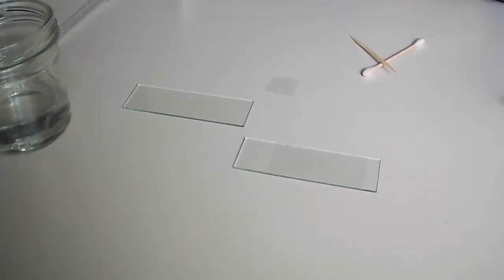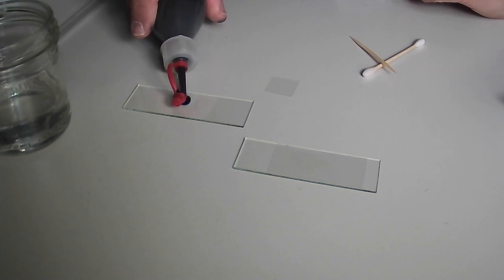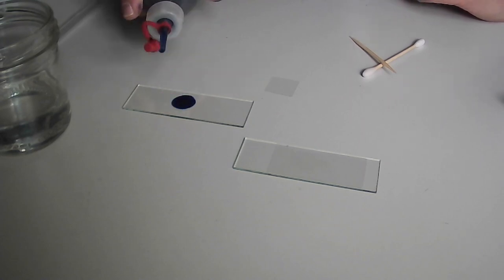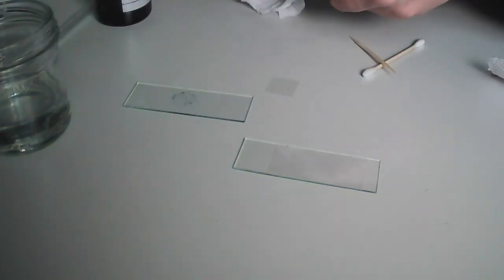Okay, so I'll be doing the following. A little bit here. So that is not the slide with the specimen, okay? That's a fresh slide. I'm just using this here to suck up some of the stain, so it's going to be easier for me to apply it. Okay, you get the idea. Yeah, so let's just do it like this.